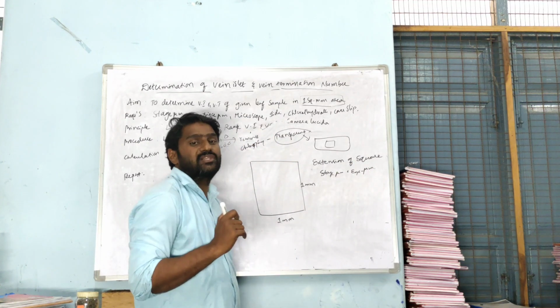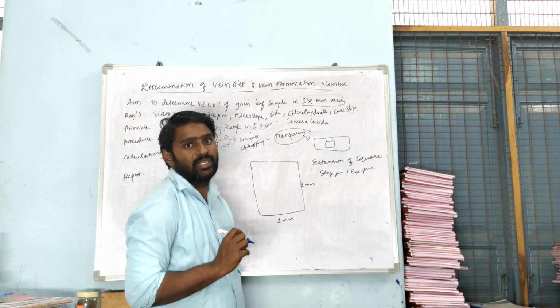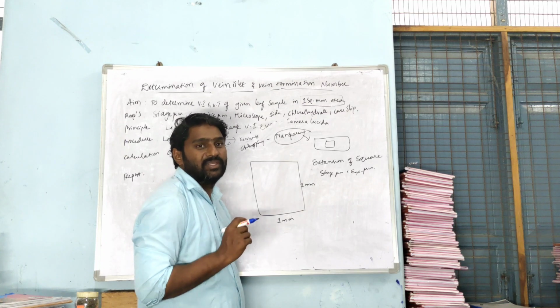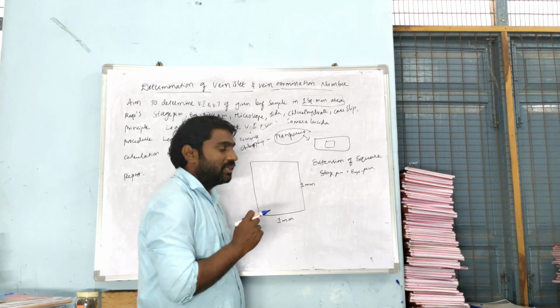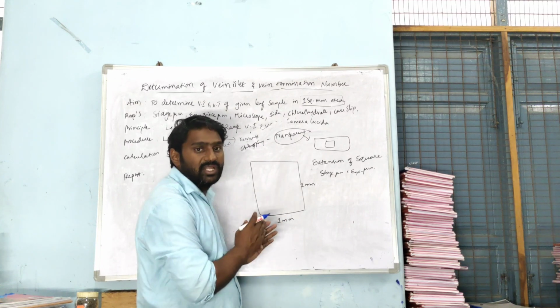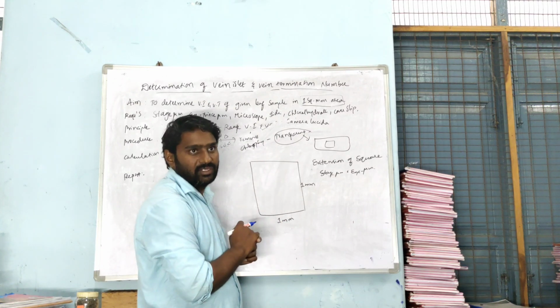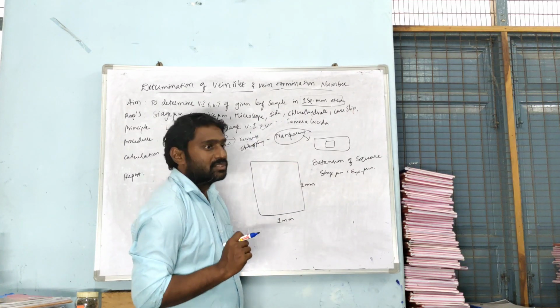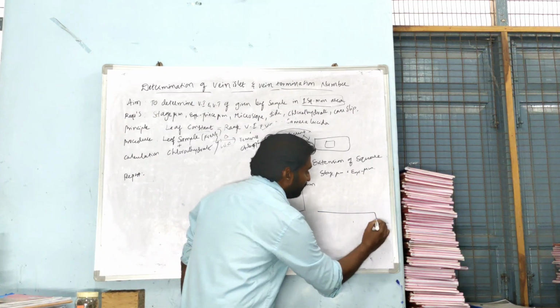The sample is placed onto the stage, and we generally use the eyepiece micrometer for tracing the images. But as of now, we don't use these two for that; they are utilized to extend the square. For extension of squares, as we are using the stage and eyepiece micrometer, there is a simple calculation that we should know.